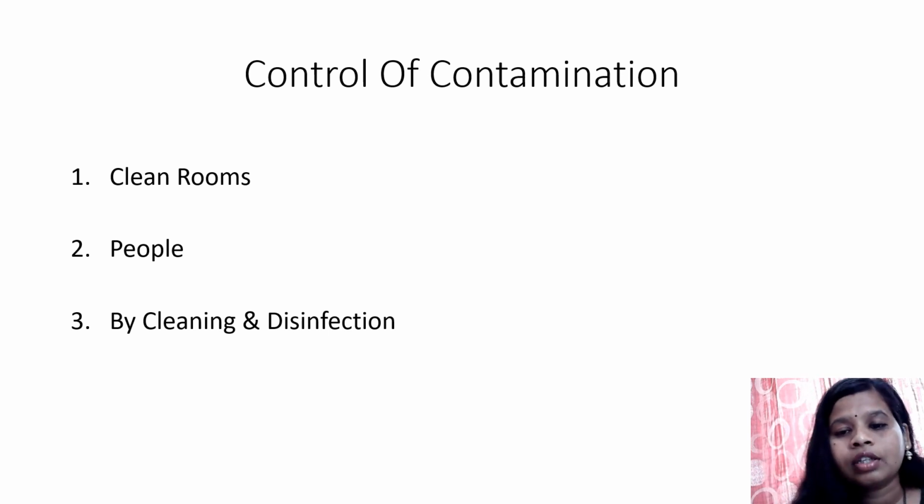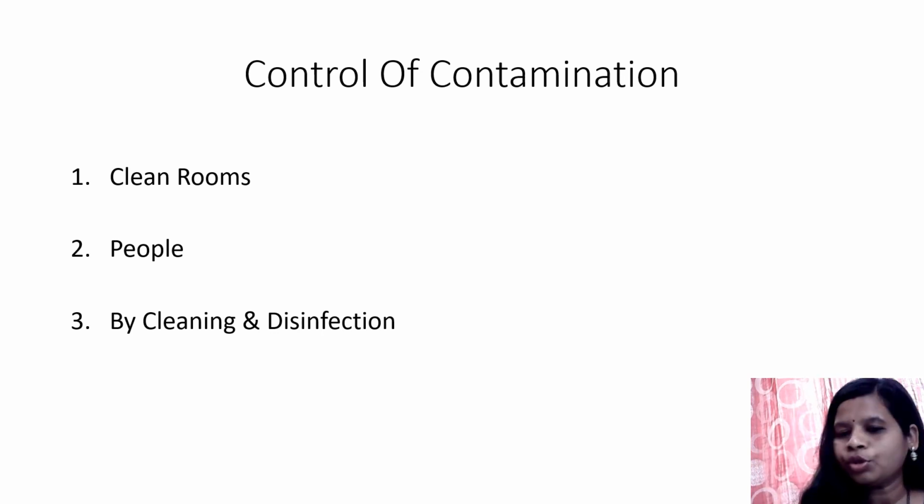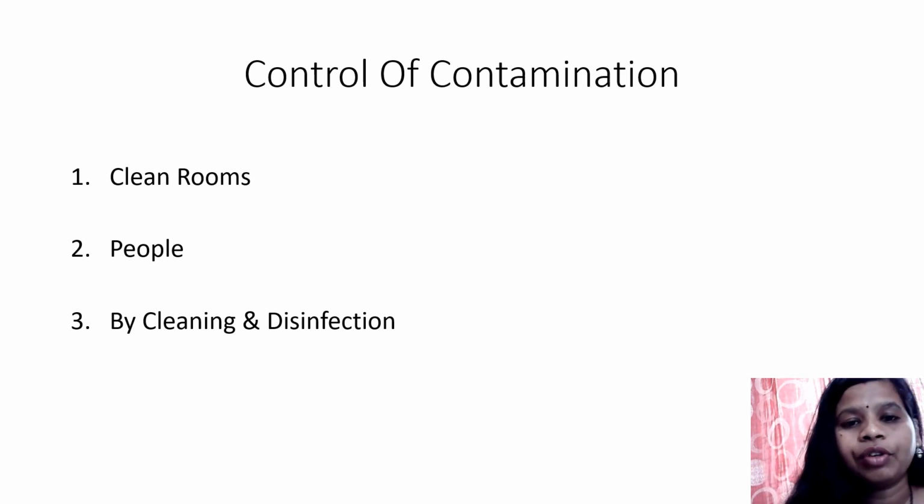And after disinfection, we should not mop once again, because this will revert the situation to cleaning. The disinfection will be reverted. So to avoid this, after disinfection we should not dry the floor with the help of a mop or something else. We should allow it to air dry. Okay, this will be done by having the cleaning and disinfection.